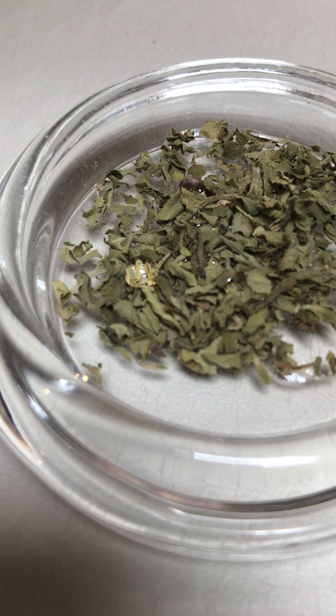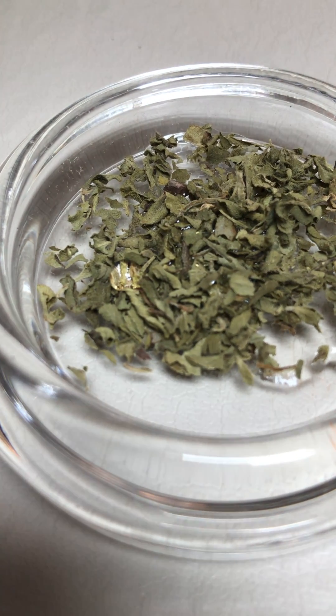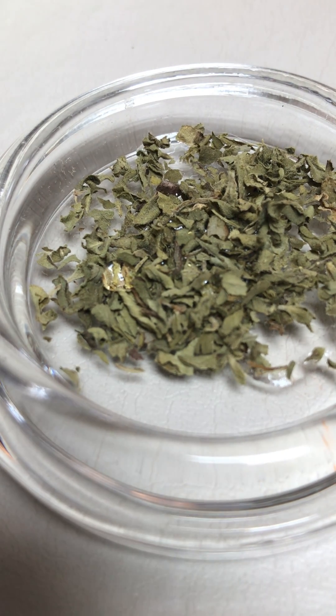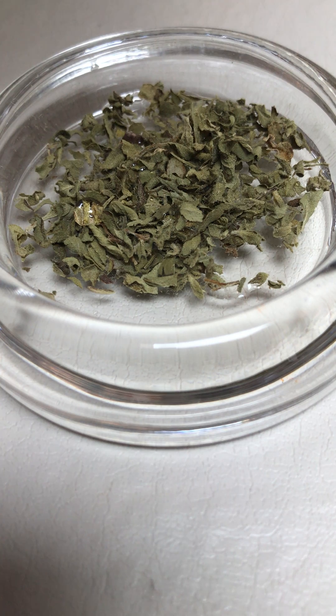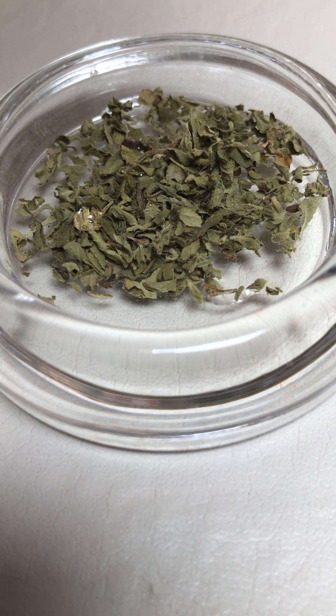Particularly on this one over here — actually it's fizzing pretty well. See tiny little fizzes and movement on the leaves themselves as the cystolithic hairs react with the hydrochloric acid, making teeny tiny little bubbles. So very, very slight fizz — it's not a lot to write home about, but it does show it a little bit.